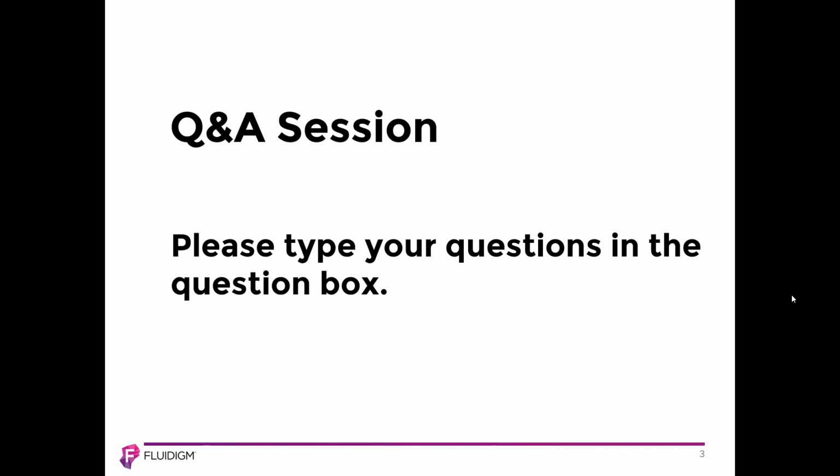Excellent. Anita, the first question is for you. The customer said that we are working with tumor samples, but we think a CD45 enrichment would be needed for better counts. Would the magnetic beads cause problems with mass cytometry? Thank you, Lindsay. That's a great question. So beads used for CD45 enrichment, like those from Miltenyi, can be used as long as they are smaller. The diameter is smaller than 100 nanometers. So that should be fine.